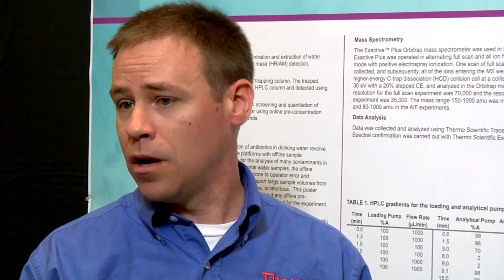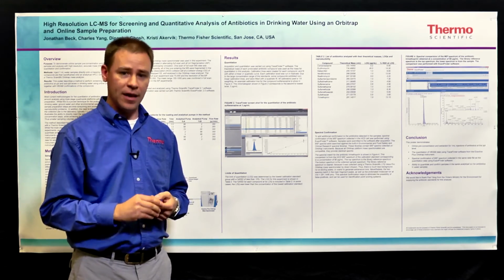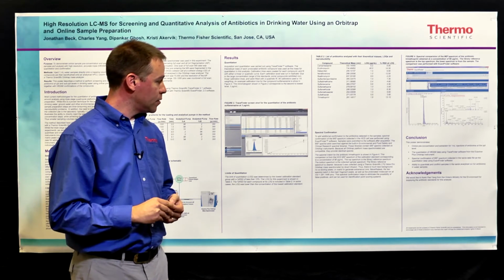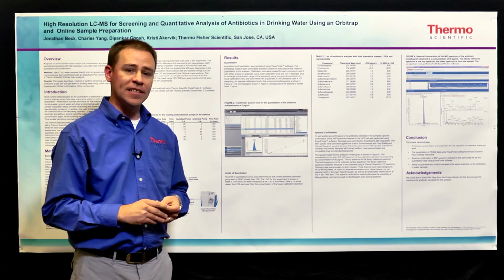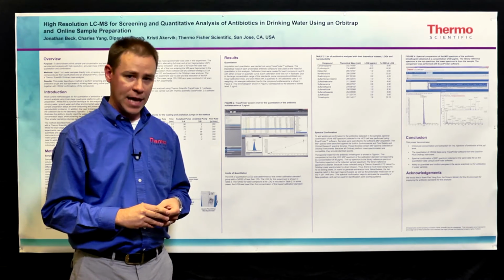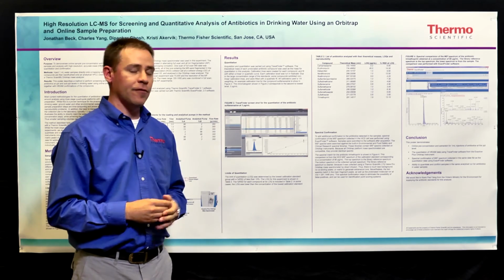Once again, we used online pre-concentration of a 1 milliliter sample of water spiked with antibiotics. We quantitated those levels to the low parts per trillion, and then we confirmed their MS full scan, high resolution accurate mass, Exactive Plus mass spectrum using the ExactFinder software.